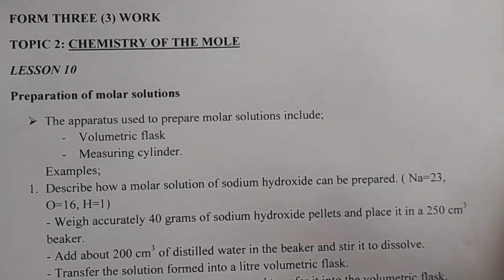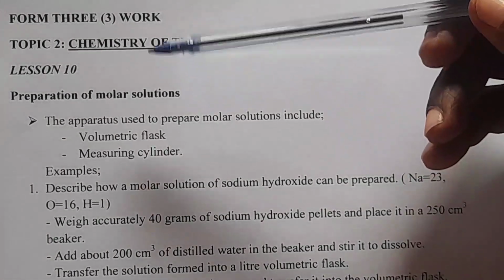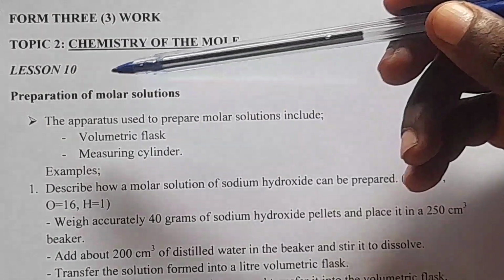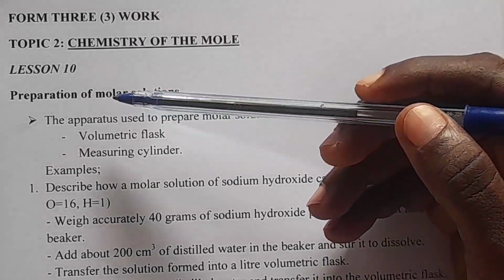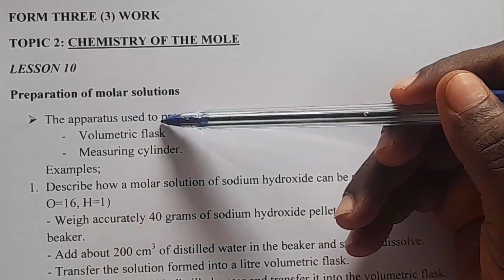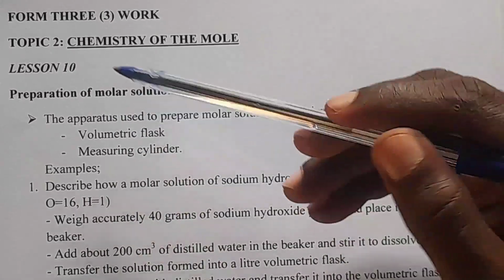Hello students, welcome. Previously in Form 3, Topic 2, Lesson 9, we were dealing with molarity of a solution. In Lesson 10 today, we are going to do preparation of molar solutions. How are we going to prepare molar solutions?